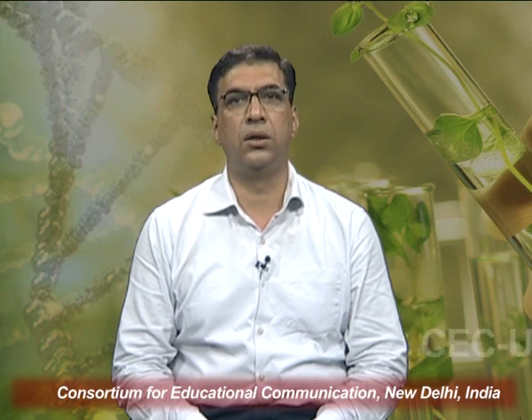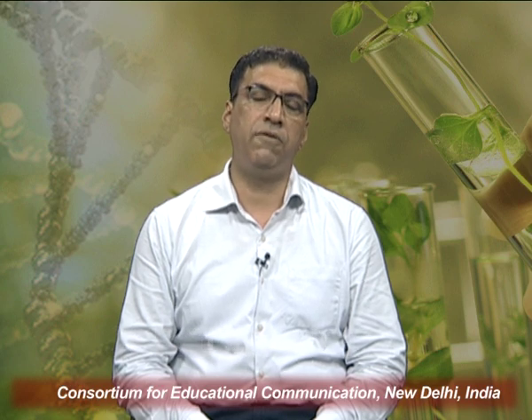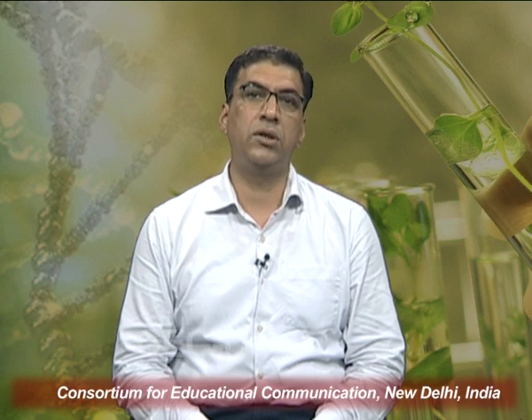I told you that a plant tissue culture laboratory is not a single laboratory but a complex of small laboratories. We also discussed the different small rooms required, with respect to the infrastructural requirements as well as the equipment required in each smaller laboratory or room depending upon its use.